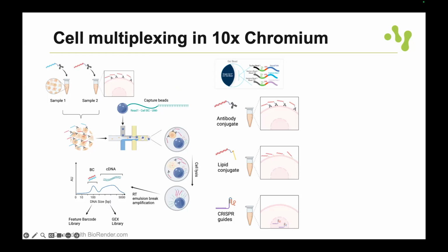Yes, but we wouldn't call that multiplexing. It's more detection of the cell types, and that's the ADT surrogate you're thinking about. You can tag different, especially immune cell, receptors, in parallel to doing the transcriptome. There's a limit in their kits, but it's also a crowding issue. Yes, if you have too many different antibodies, I guess.